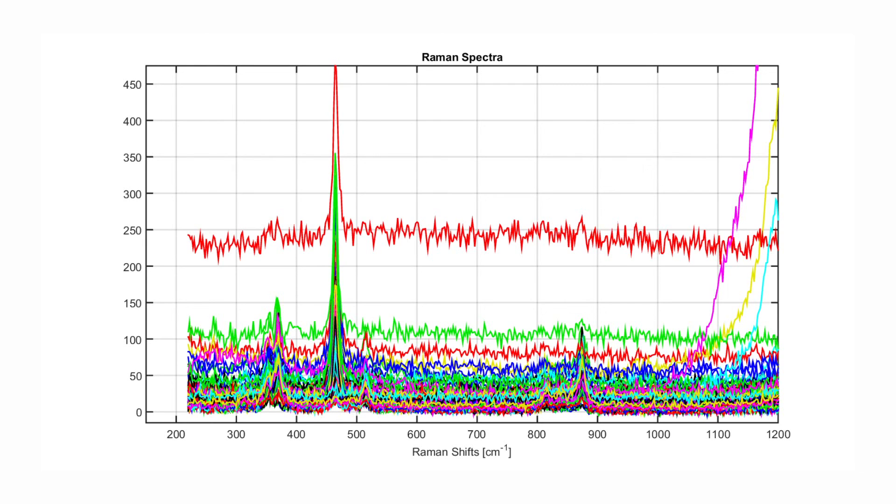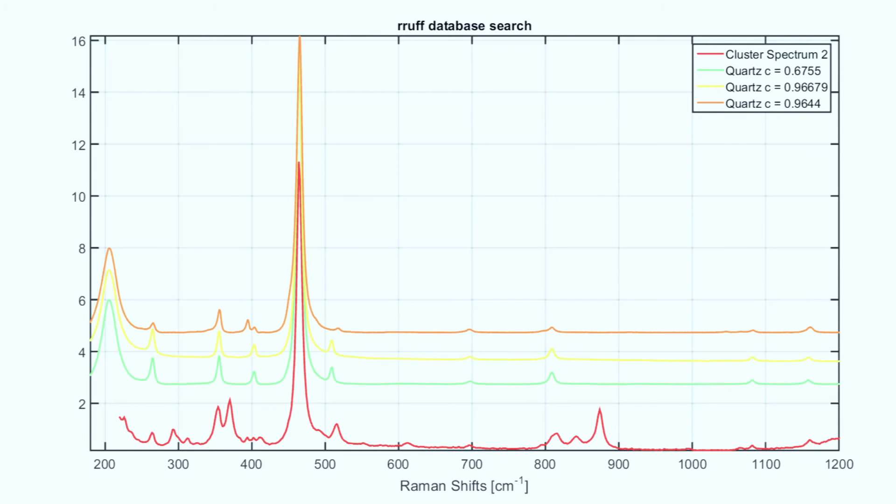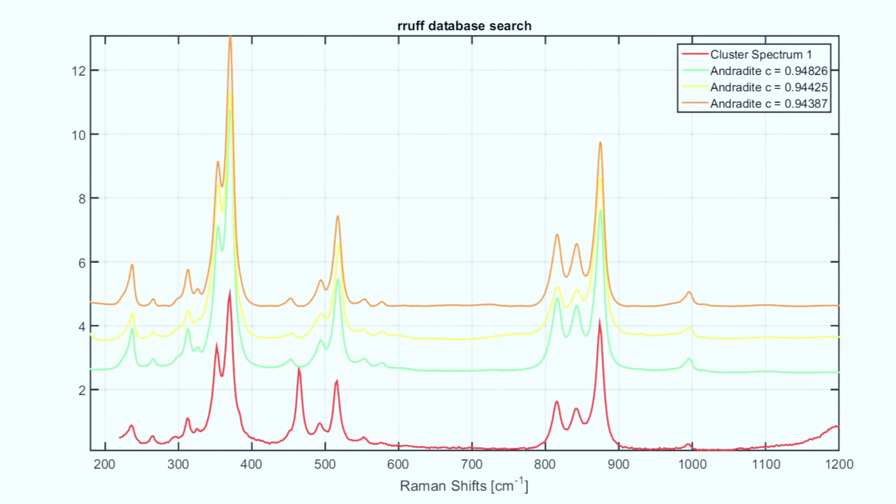Comparing the cluster average spectra with a spectral database identifies the rock material as a mixture of quartz and andradite.